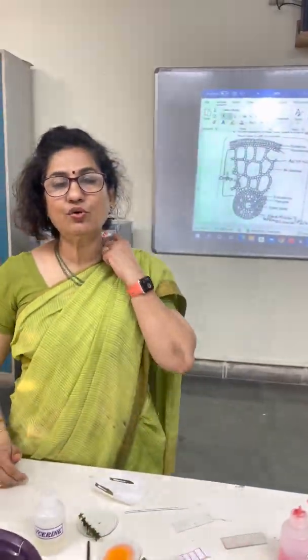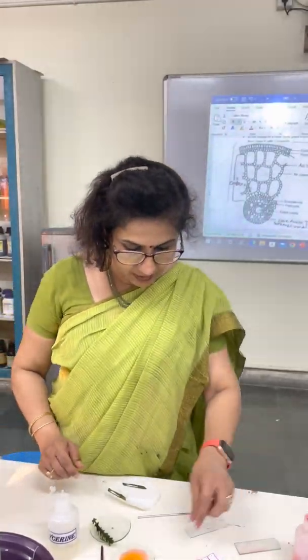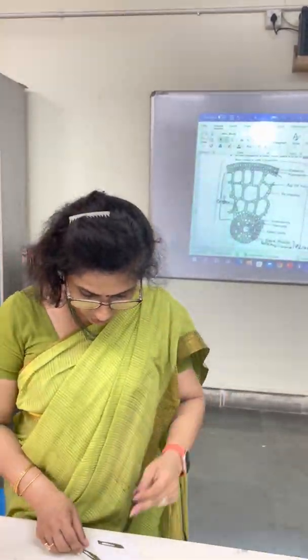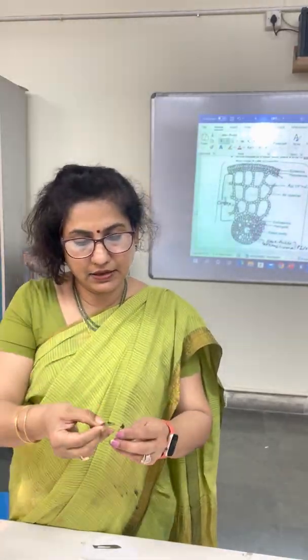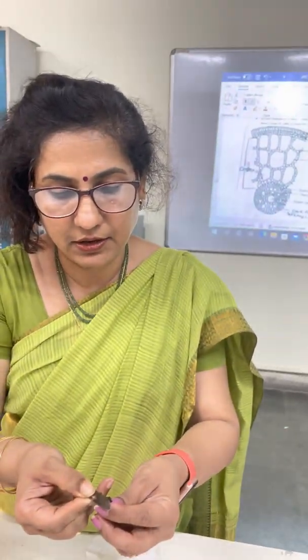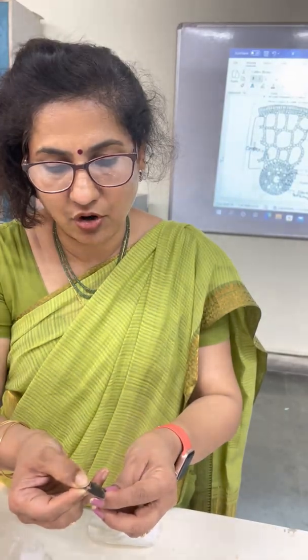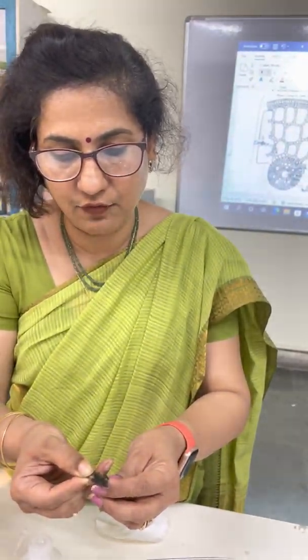Now I will show you how to cut the TS of this Hydrilla stem. Hold the stem in your left hand and hold the blade in your right hand. Cut thin slices of the Hydrilla stem just as you cut slices of cucumber at home. Make sure the tissues are not injured and the slices are very thin as well as evenly cut.